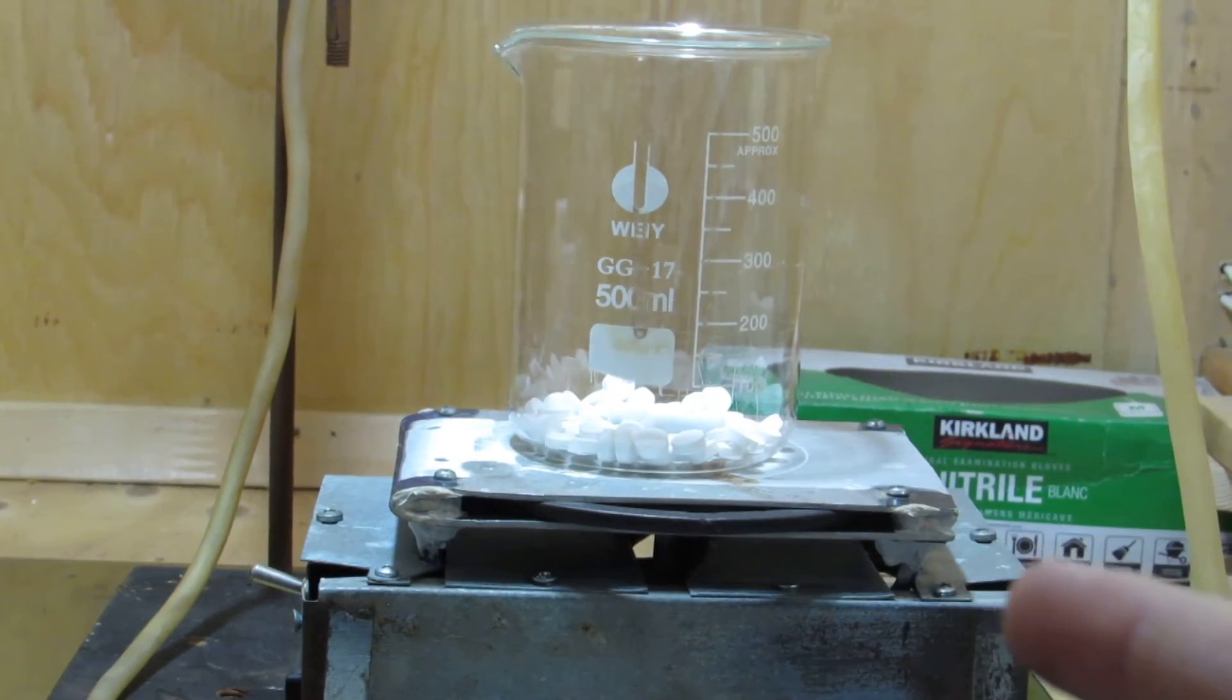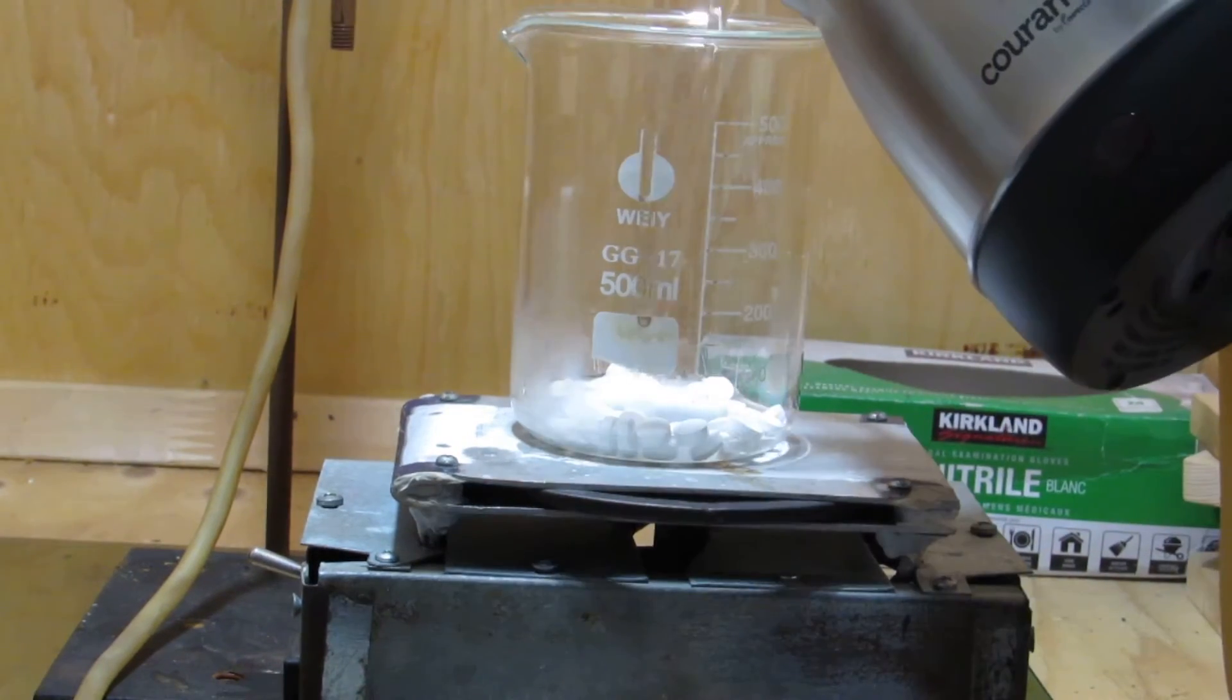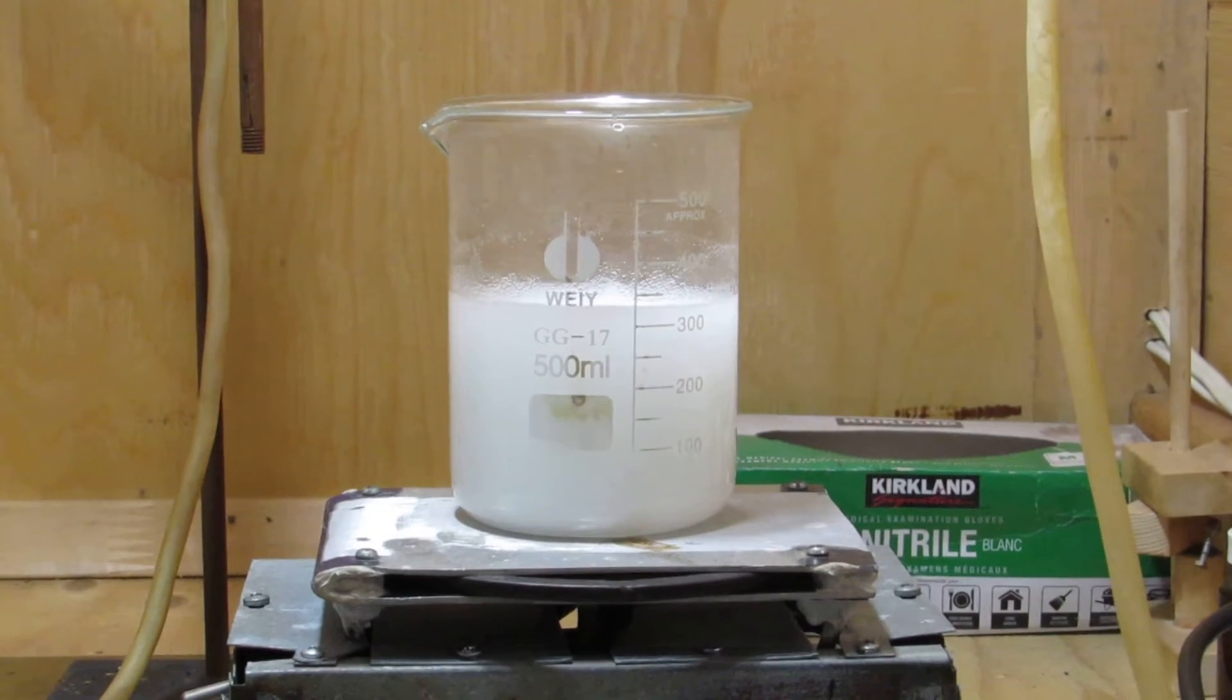To begin, 50 pills are added to a beaker on our homemade hot plate stirrer. Next, around 300 milliliters of hot water was added and the solution was stirred to dissolve all the caffeine.